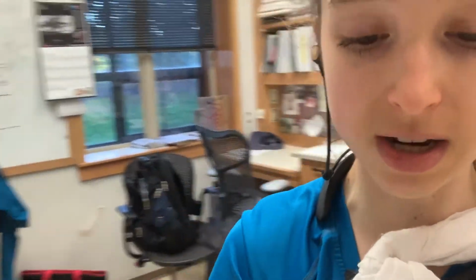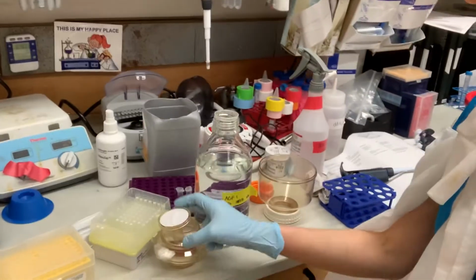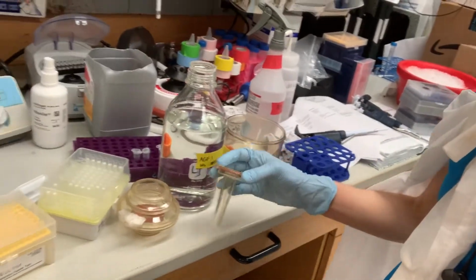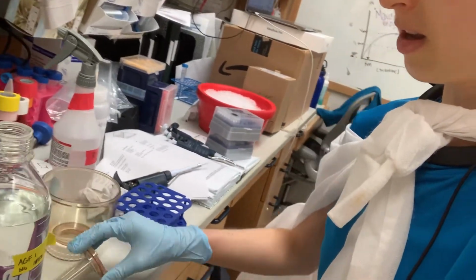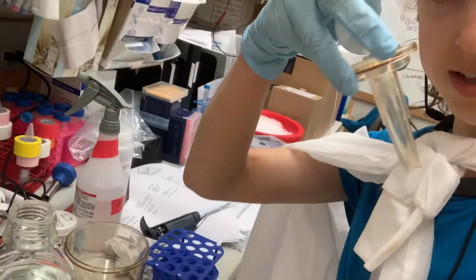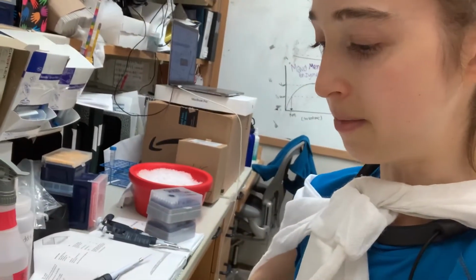At this point, it's time to filter them. You don't always have to filter your solutions, but I tend to always filter my solutions. So I use this vacuum filter. It comes in these 3 pieces. So you have this part, this part, and this part. And this is a reusable one.